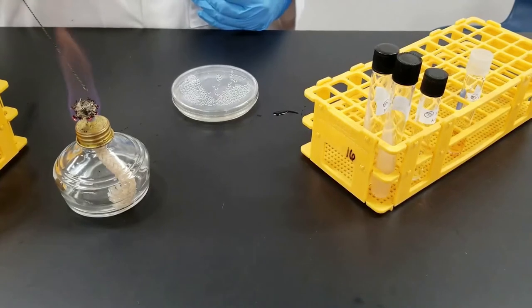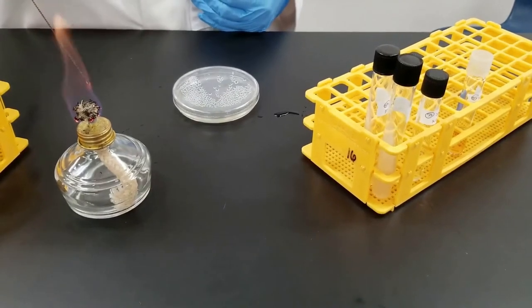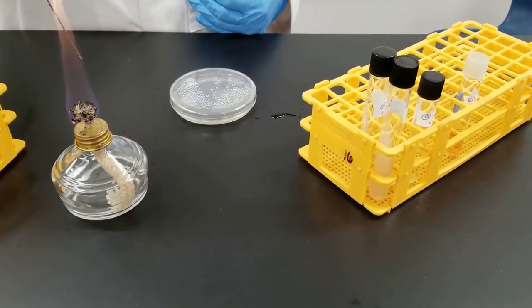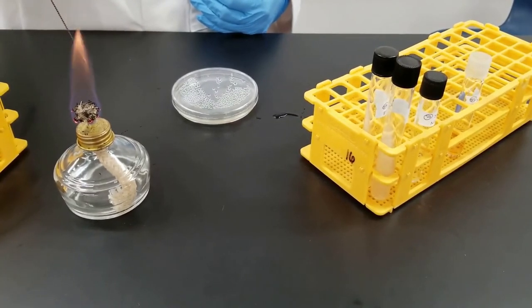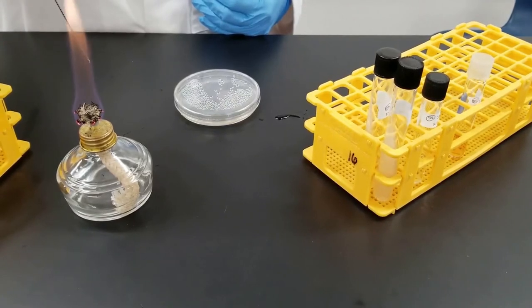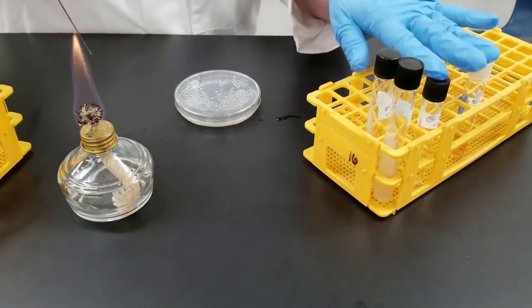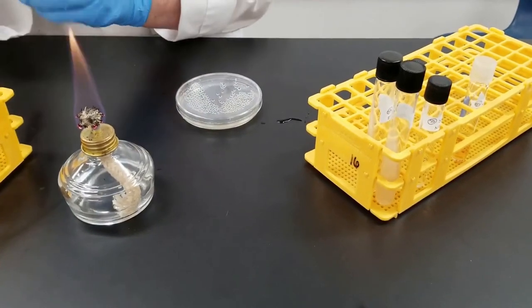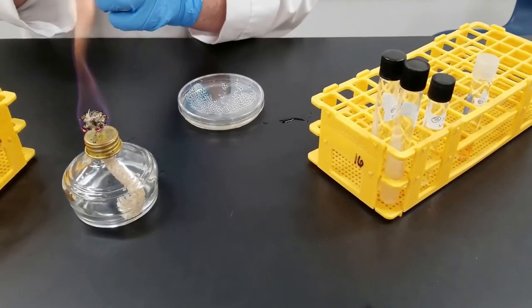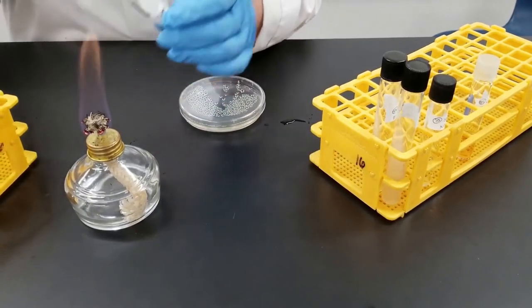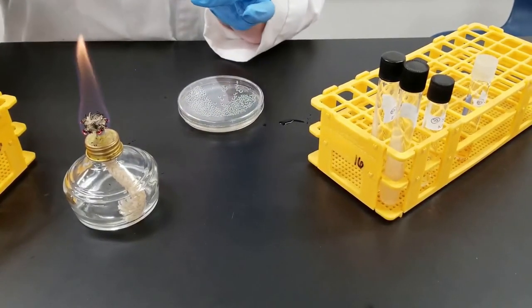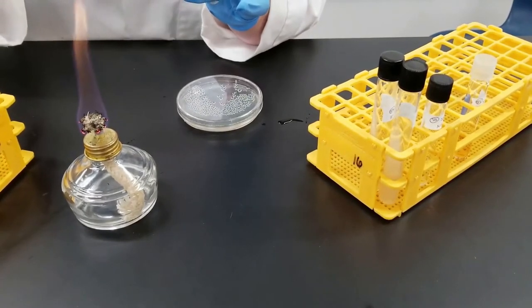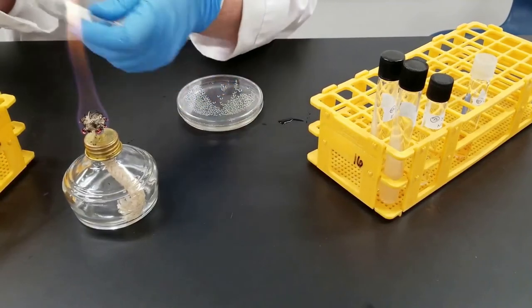So as usual, we need to sterilize our loop. And as I said, we are going from a liquid broth culture to a couple of broth cultures and also from the liquid to solid. So we're going to take a little bit of water. Always flame the tube. Dip your loop in.